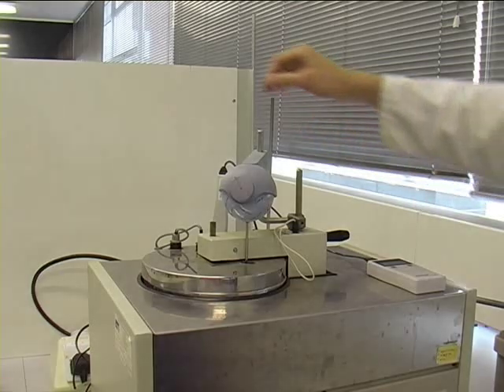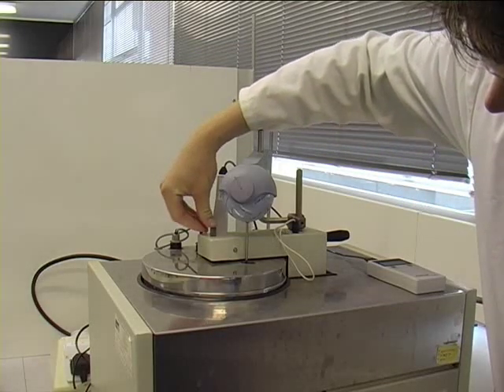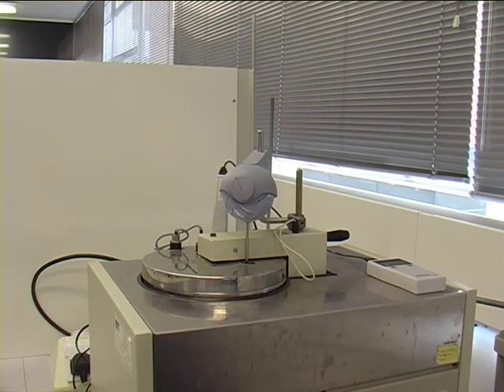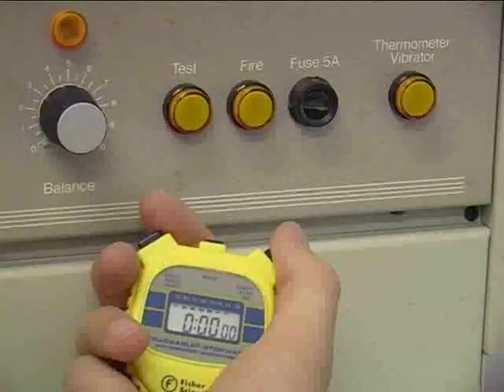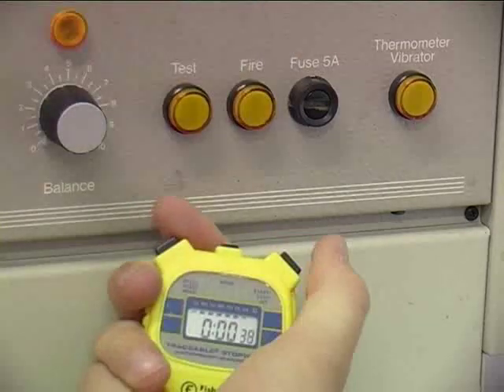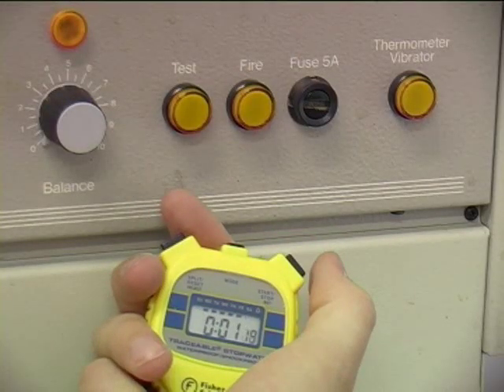Once the ready light on the calorimeter has come on, the apparatus can then be fired by pressing and holding the fire button. Once fired, the temperature should be monitored every minute until it stops rising. At this point, the apparatus can be disassembled.